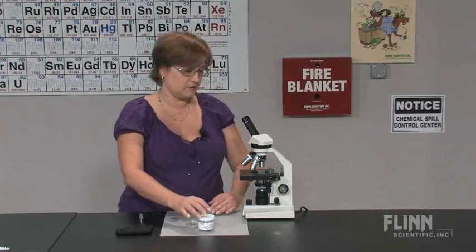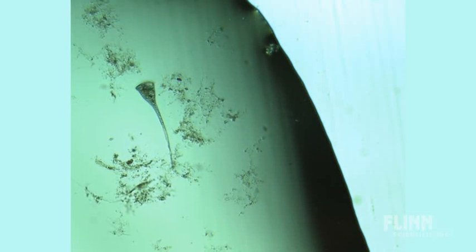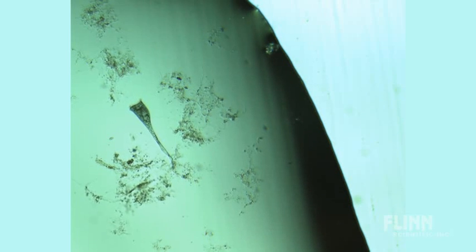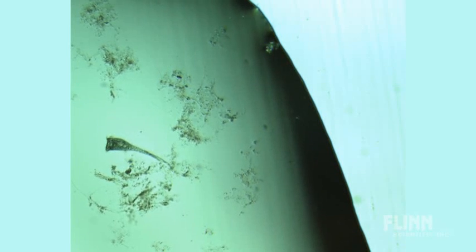Now, although they have a symbiotic relationship with the blue-green algae, they don't like a lot of light, so we're going to keep the microscope dim. Look through the preparation, and they will be swimming, because now they've been disrupted. Follow your stentor, and they will land on some debris or on the bottom of the well slide, where they'll attach and begin to feed.